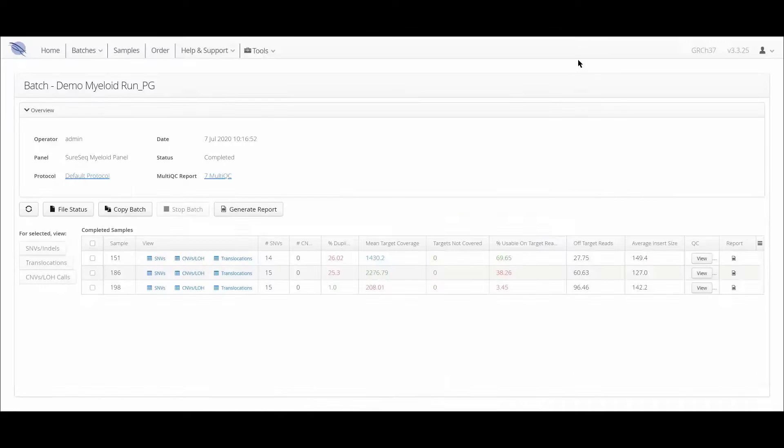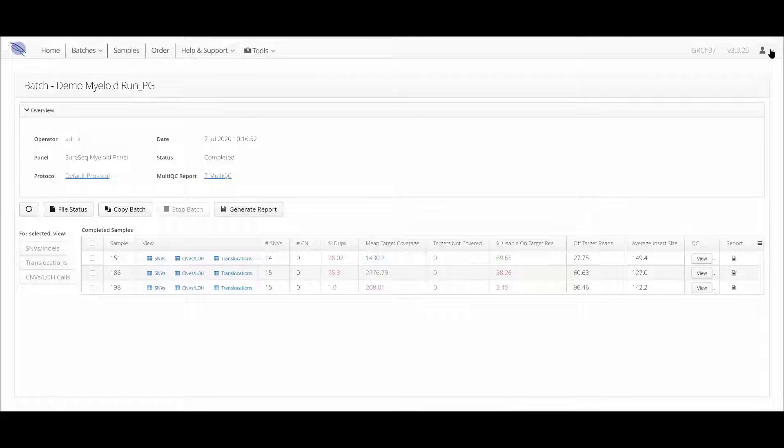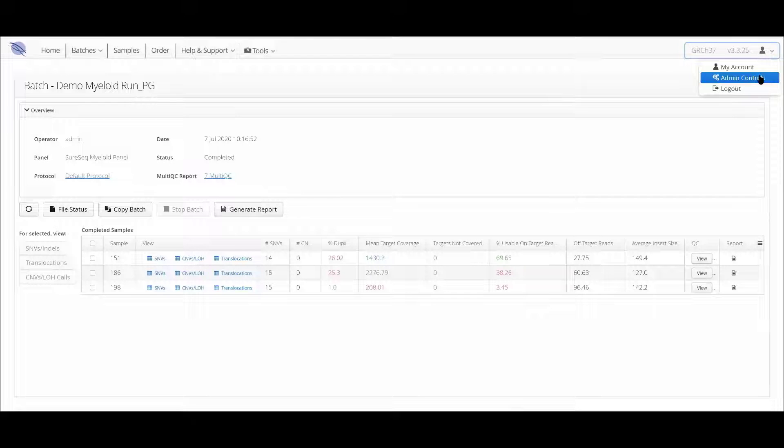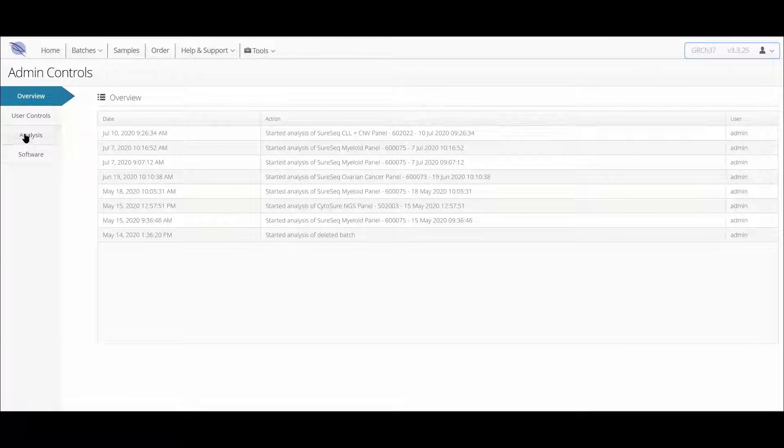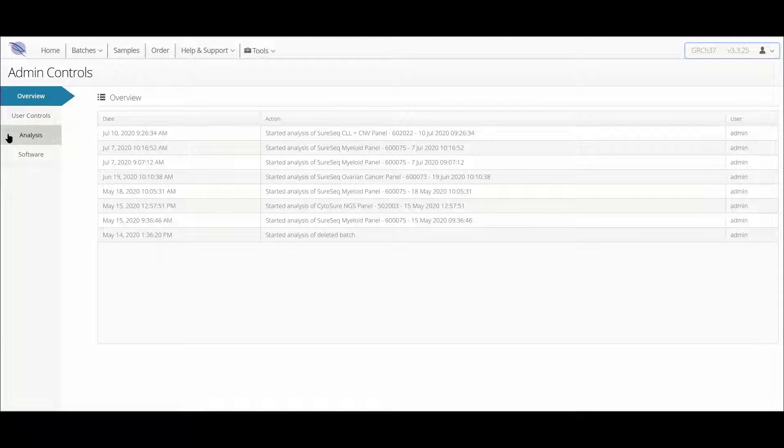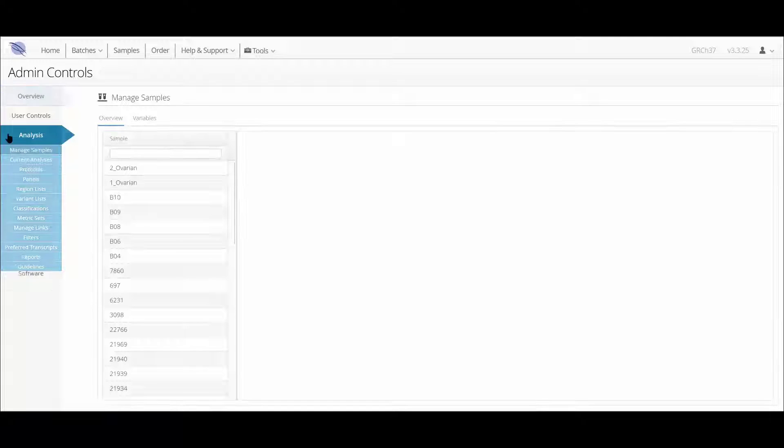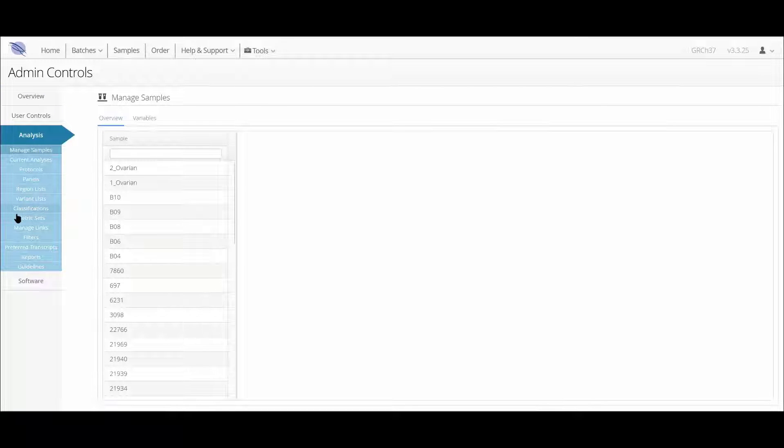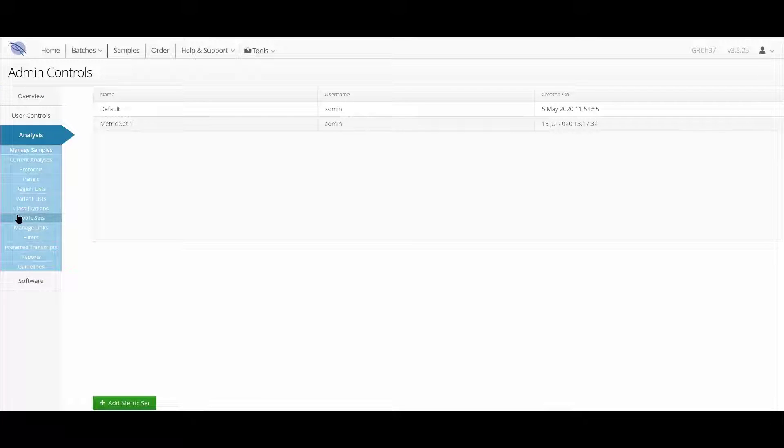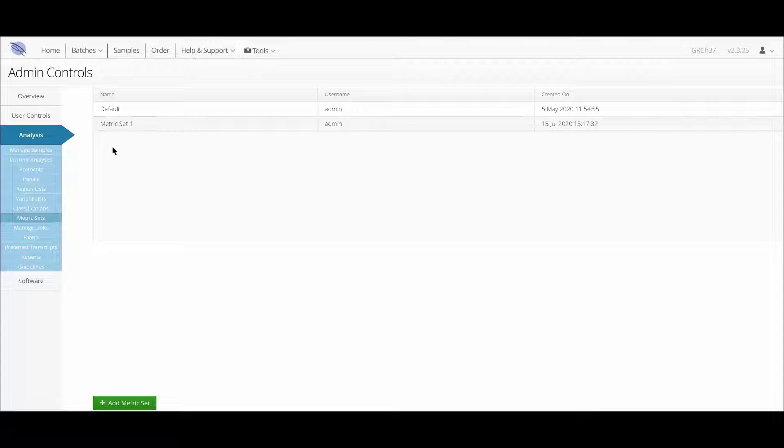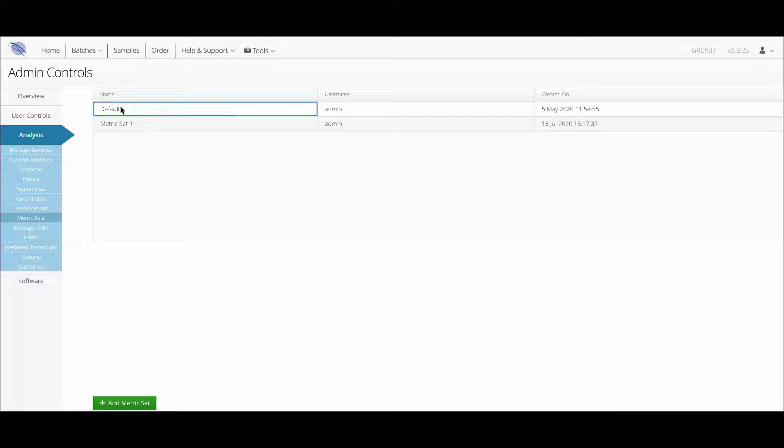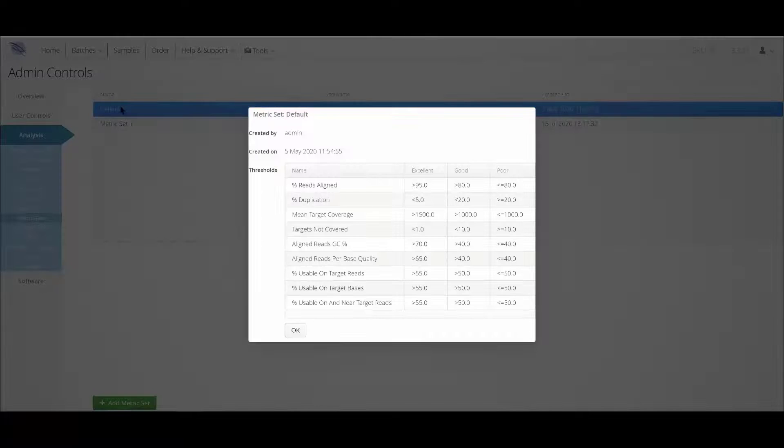We can do this through the admin control area by opening up the analysis section, and from here we can select metric sets. A list of all the currently available metric sets is displayed. Clicking on a row in this list will bring up the details and the threshold values that have been assigned.